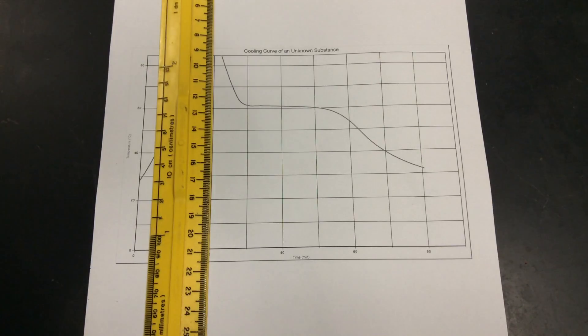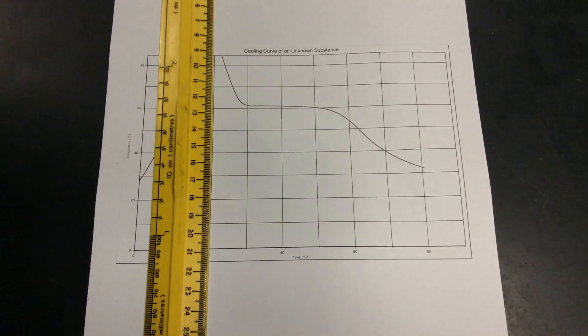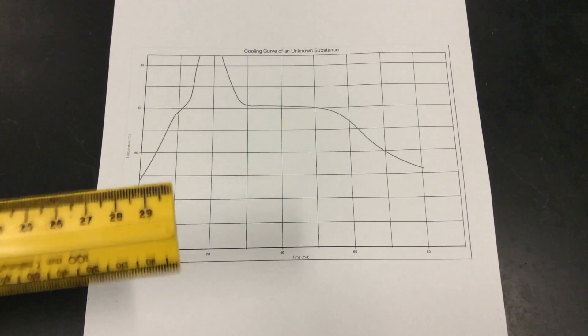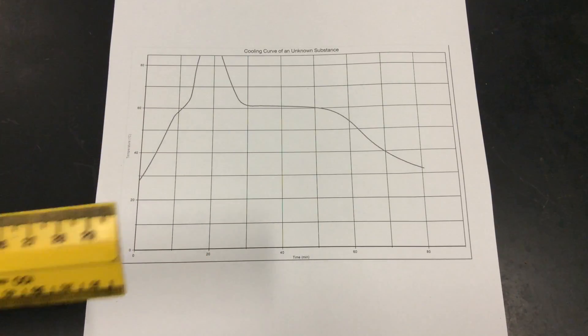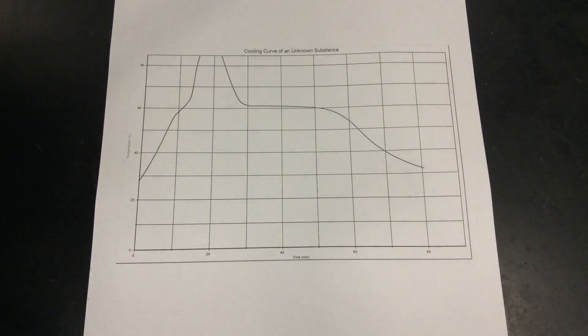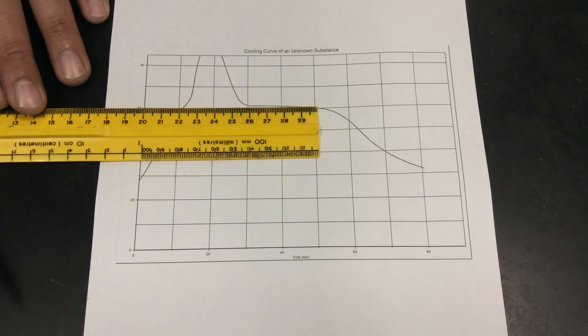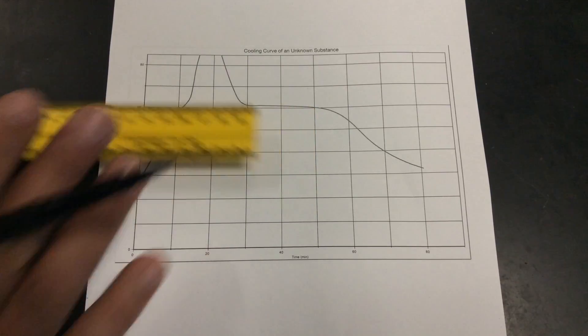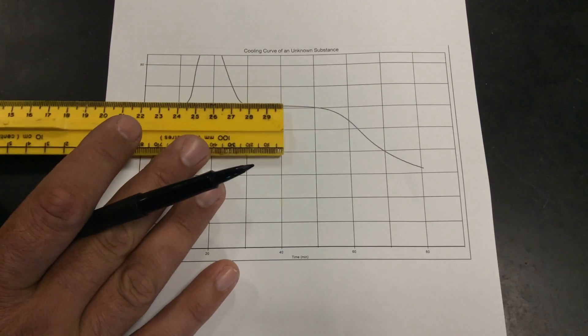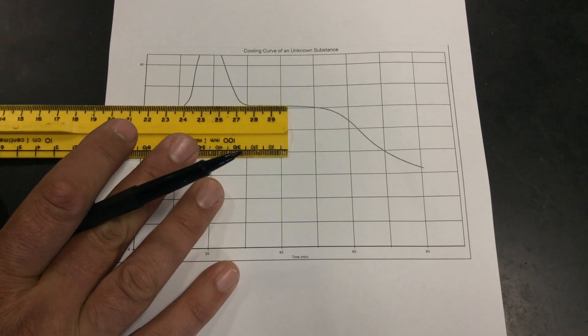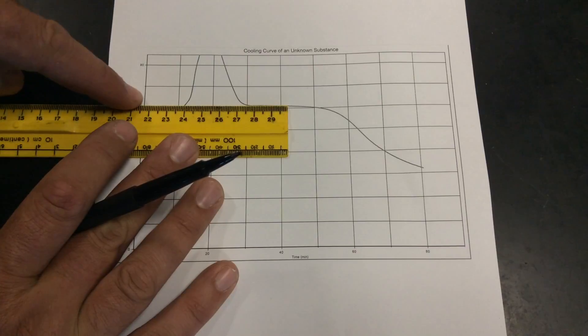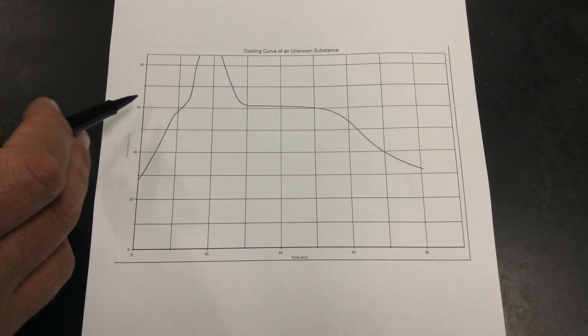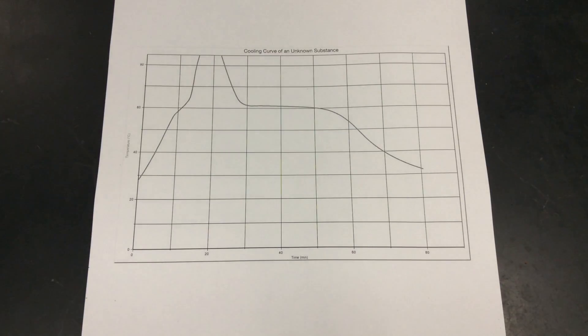If you look at this, there's no real mystery here. We know that at a phase change, the temperature is going to stay constant because of the conversion of potential and kinetic. Therefore, we're going to look at the most flat line place and you're going to basically take a straight edge and try to find the region where your line is the most flat place where the kinetic energy, which by the way is your temperature, stays the most constant. Find where you think it stays the most constant and then draw a line over to the y-axis and try to determine what the temperature is. I want you to mark that and I want you to say melting point based on your graph.